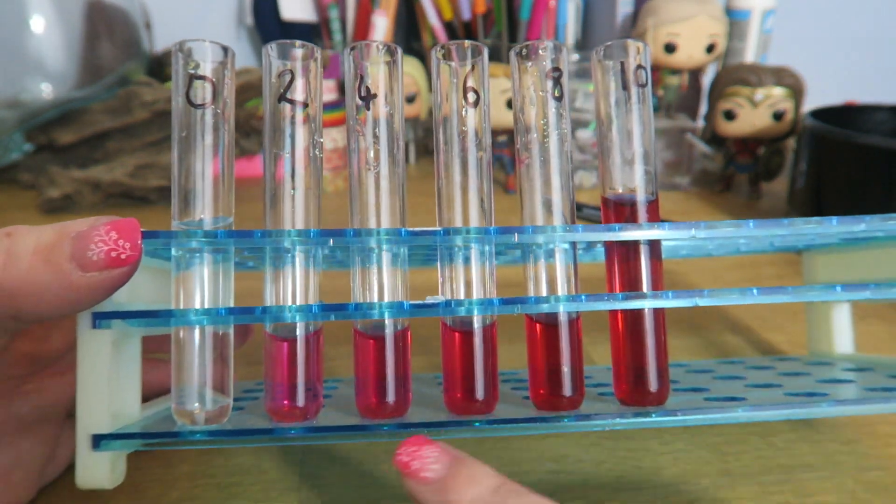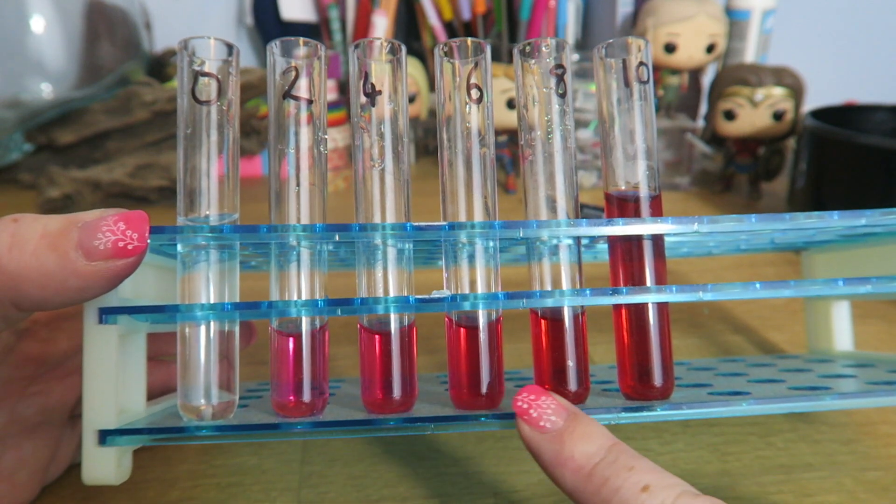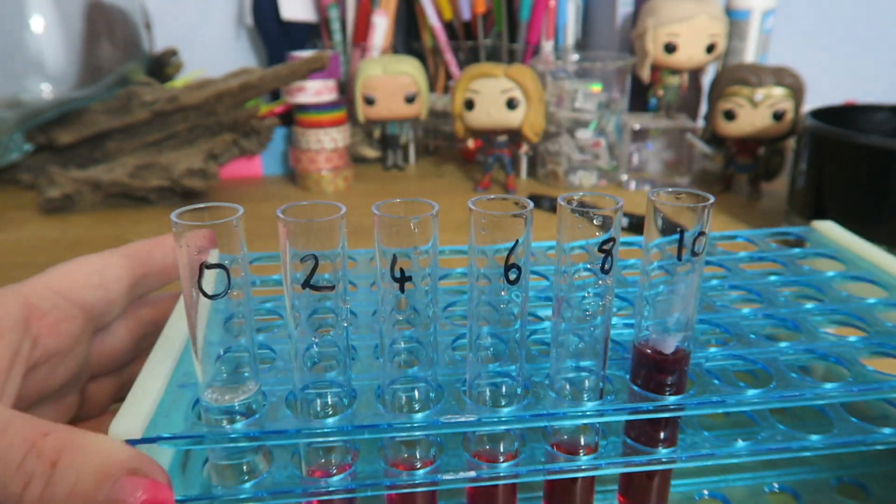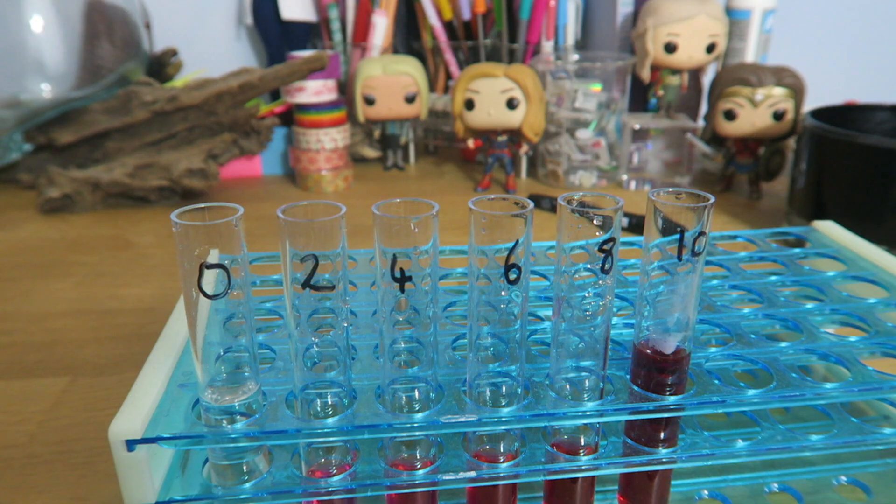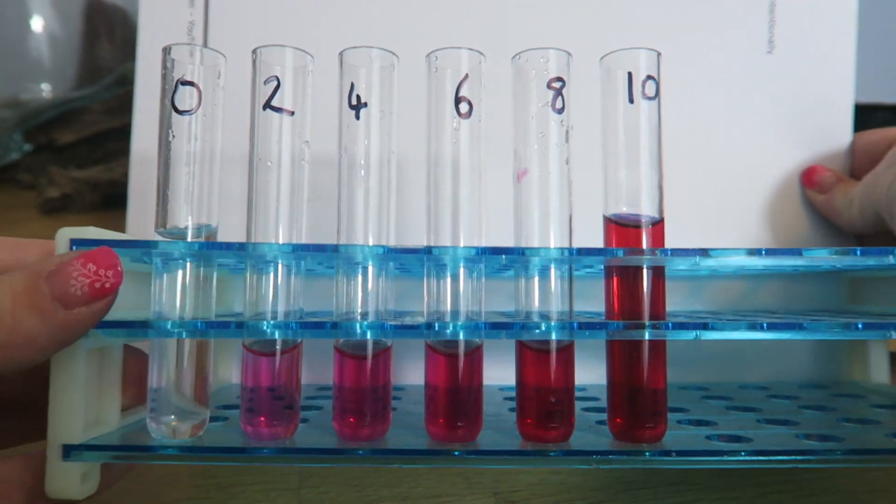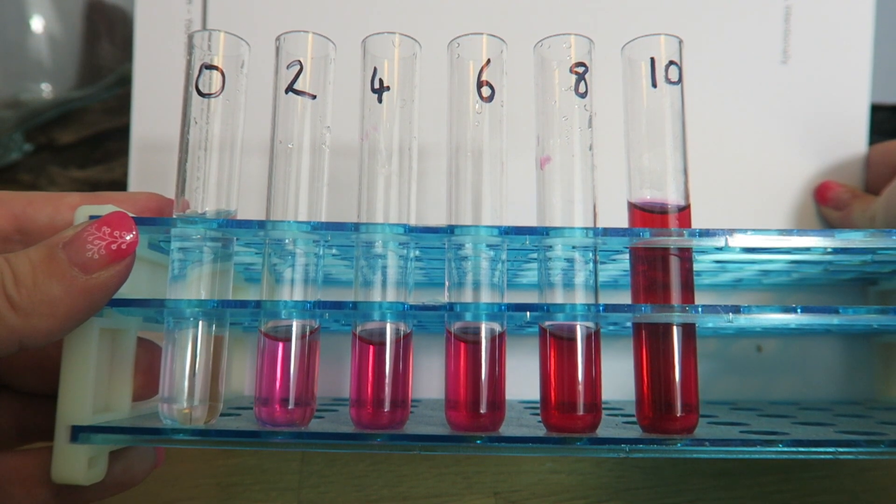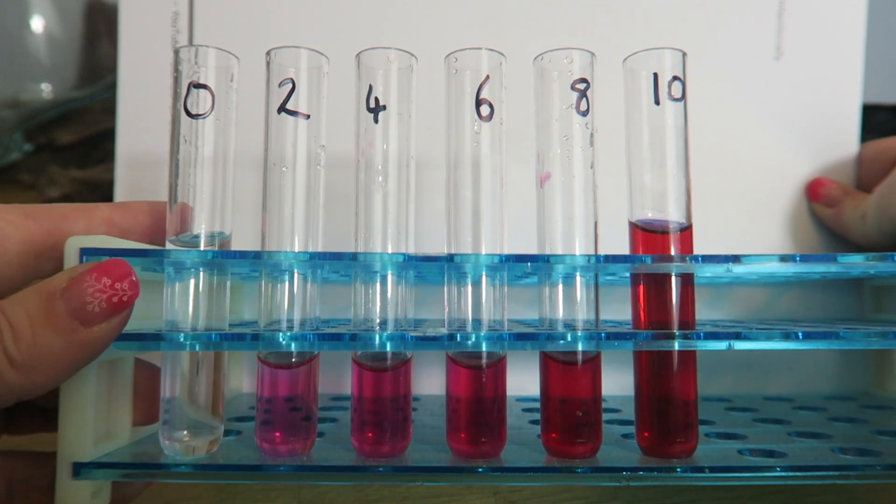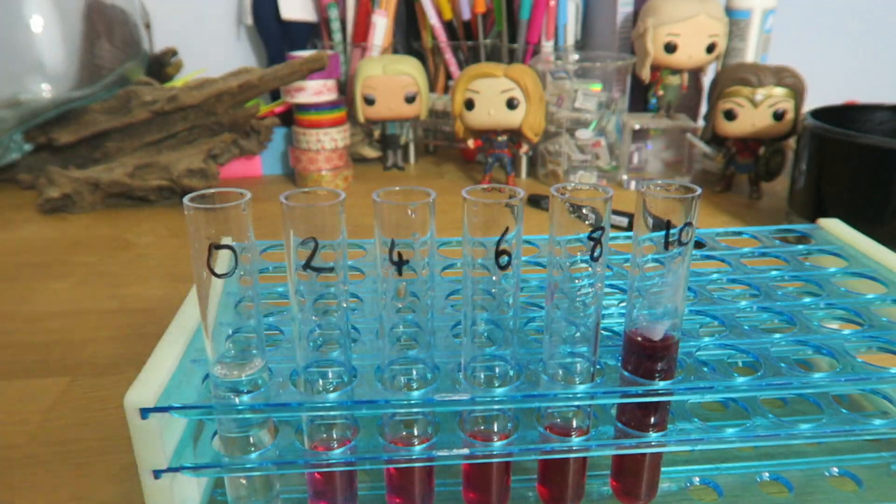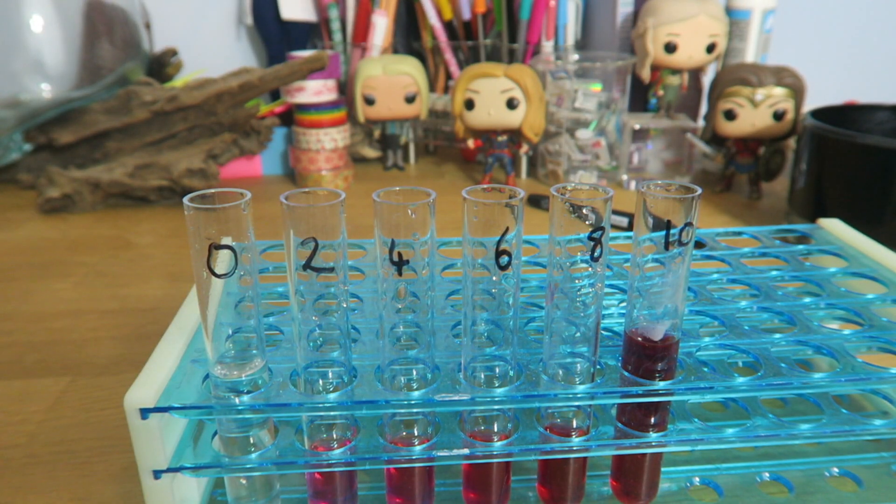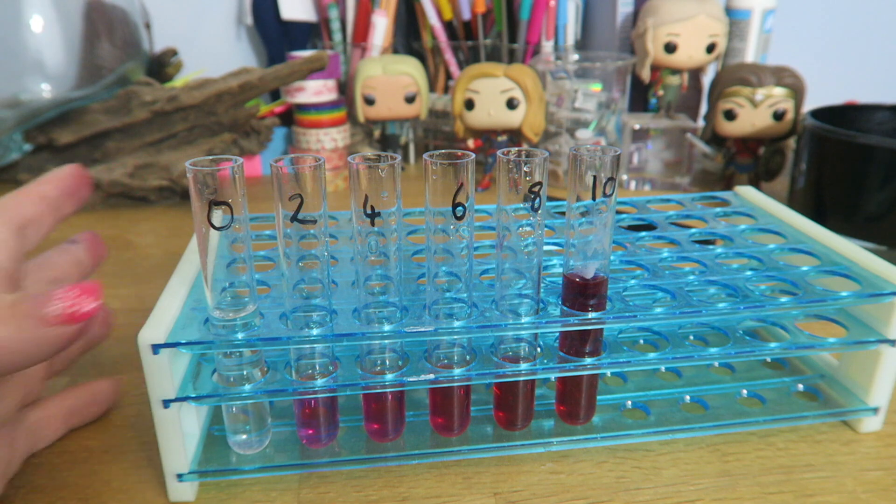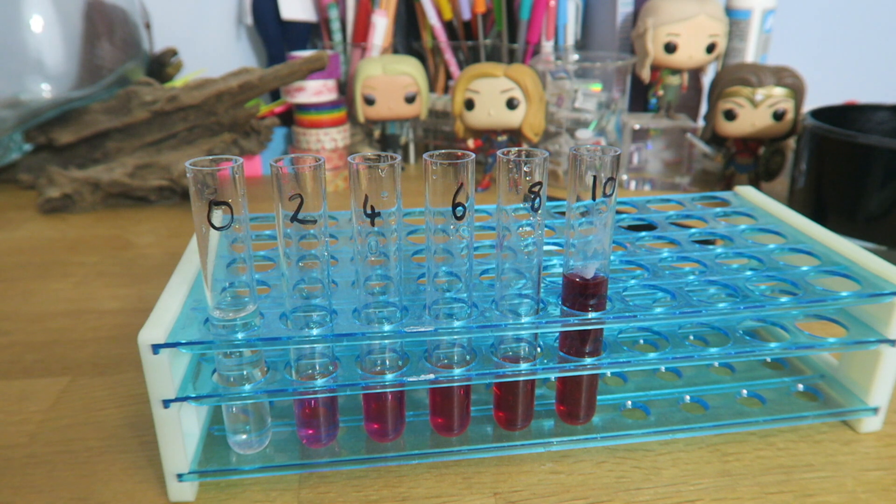You should now be able to see a gradient of colour across here. I'll just get some white paper, stand that behind, and you should be able to see that colour gradient a little bit better. White paper is really helpful for helping you work out things. So, this is part one. That's our standard colours. Yours may look slightly different. That is fine, as long as you've done this carefully, as long as you've done it properly. And now we can move on to part two.